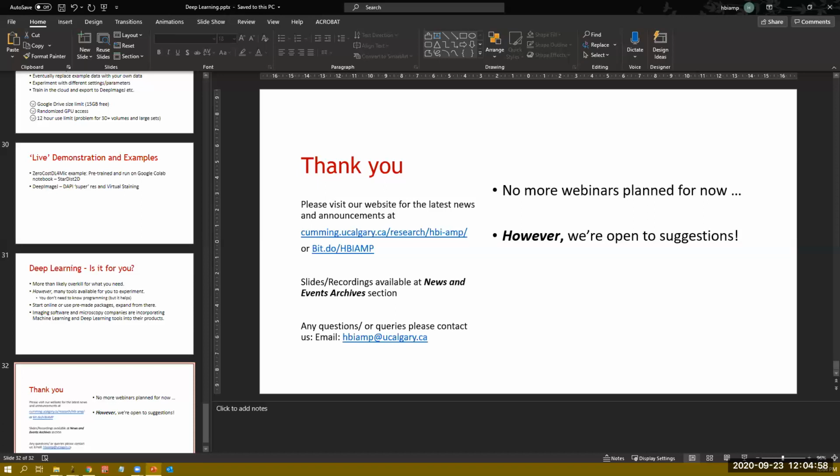So not only that a noise is present there, but what is the shape of that noise, what is its intensity, and so on and so forth. So there's many parameters that come into the deep learning model to eliminate the noise, versus the spatial filtering, where it's one parameter at a time that you test and see if it affects it. Yeah, it's kind of like machine learning, deep learning. It looks at all of those 2D spatial parameters at once and sort of figures out what's relevant and so forth.